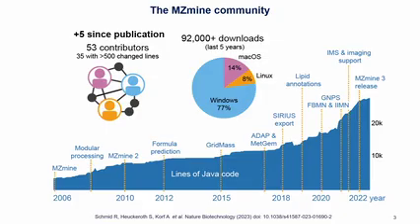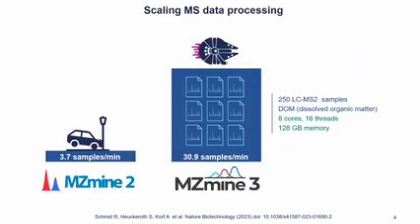Okay, so it's a platform with quite a bit of history. And in the third version of MZmine, one of our focus areas was also performance.